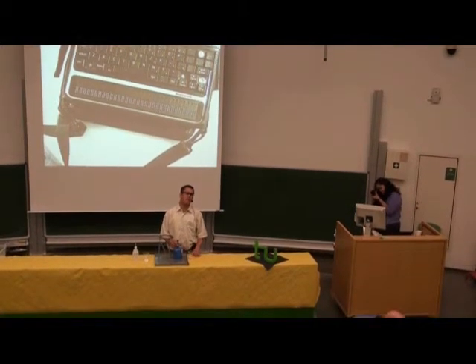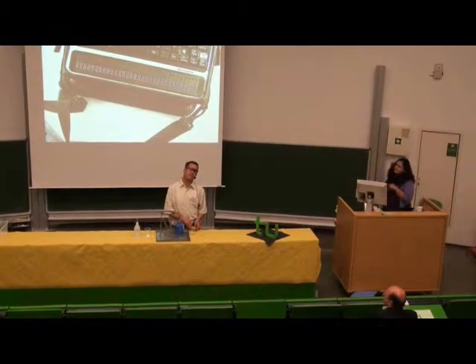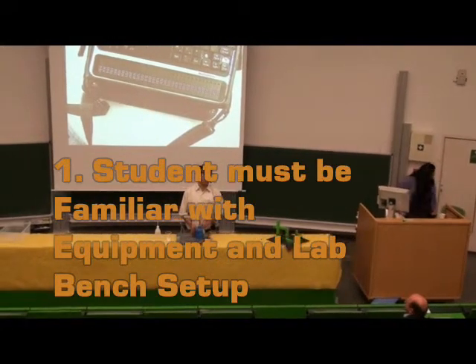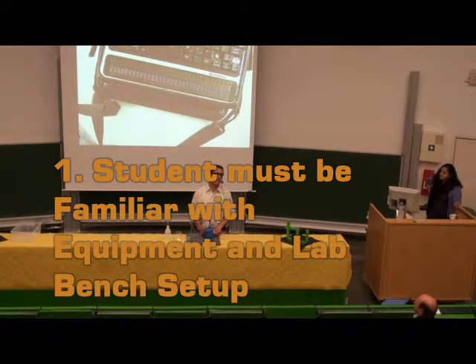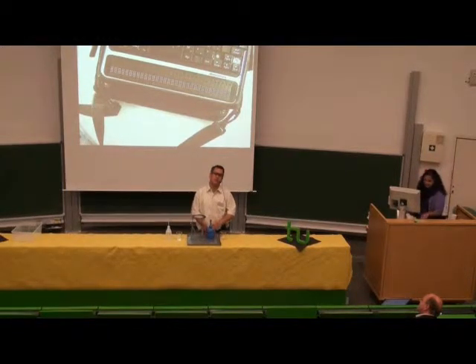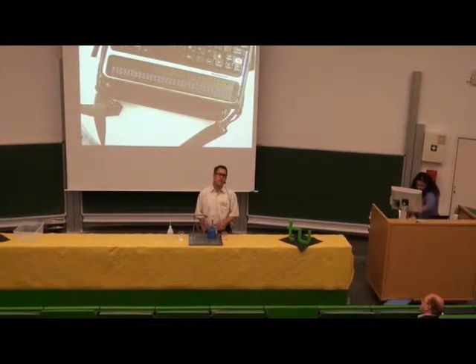Several of you have asked me, how do you work with flames and things of that sort? And I said, I'm just going to show you that. So when working at the lab bench for any visually impaired student, they have to be familiar with what they're working with. You want your students to have ample time to examine the equipment. So this is a burner, this is our wire gauze and the ring stand. And we have a beaker over here, and matches. You want to know where everything is.